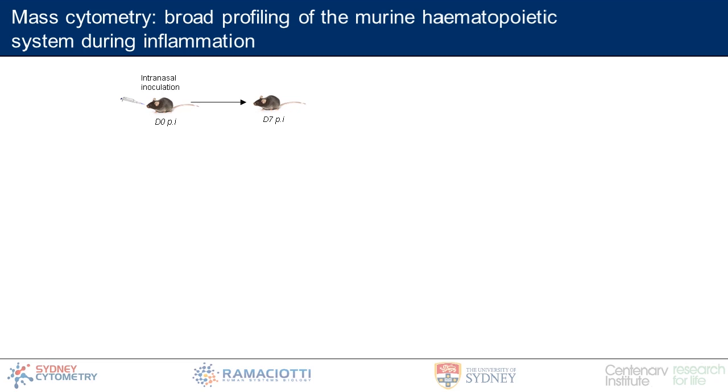And 6 to 7 days later, the mice reach the peak of their disease, and in our full dose model, this is 100% lethal, and so all of these mice will come to the encephalitic disease. In this case, we can extract various tissues. For us, we're mainly focusing on central nervous system, which is the brain, as well as things like bone marrow or lymph tissue. These cells can either then be separated out into a suspension, or we can embed these in paraffin or in a frozen media of some kind for imaging.